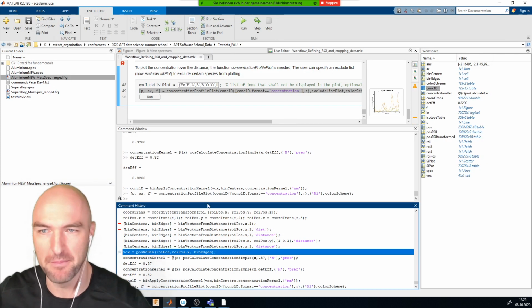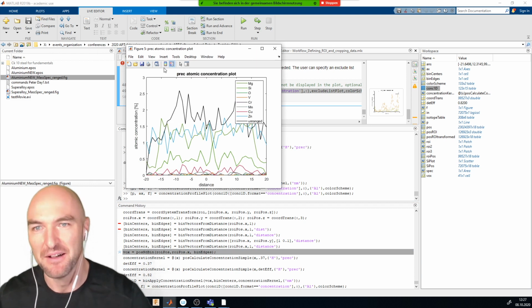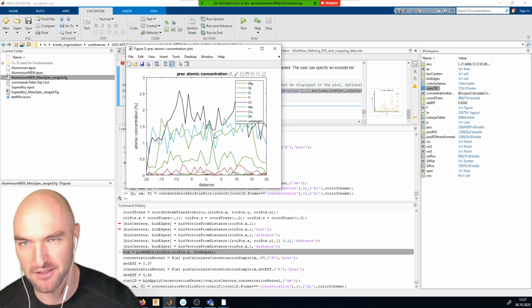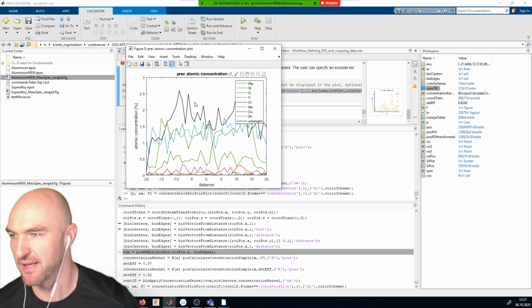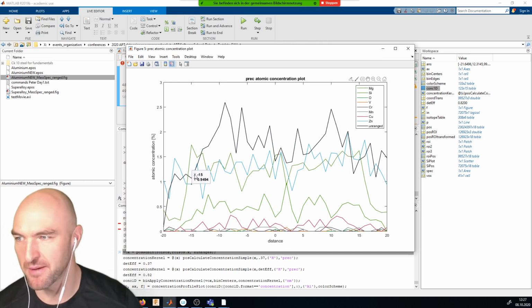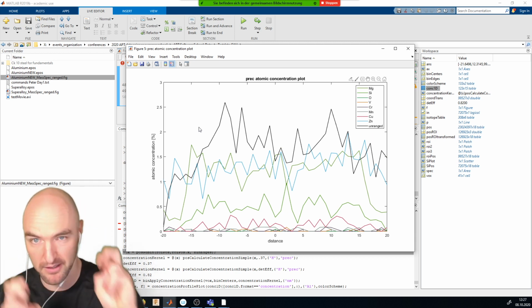One of the things why I'm relatively not super happy about putting those in is one thing that I can actually show you pretty well on one of those plots: plotting the variance doesn't, on a plot like this, make all that much sense because you can see the variance, right? The variance is the square root of the counts. Yes, it has a very defined statistical meaning. It's the square root of the counts compared to the overall count. So it's in percentage in this case. Sorry, in absolute values. But it doesn't make that much sense to plot the variance because you can see it, right? So the variance is essentially what we can see here as measurement noise or as counting noise.